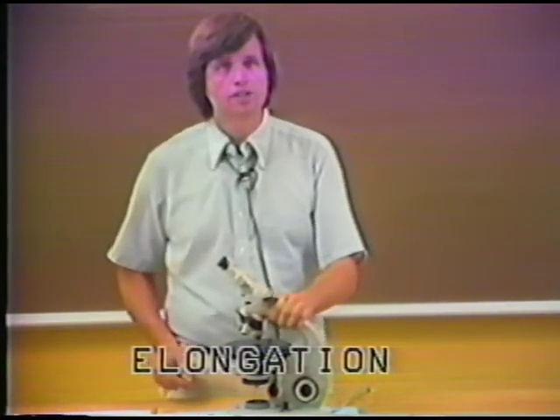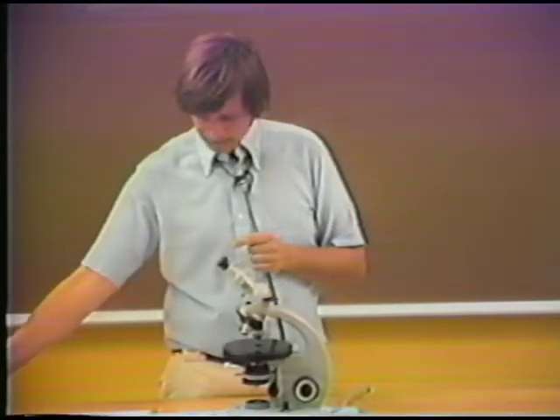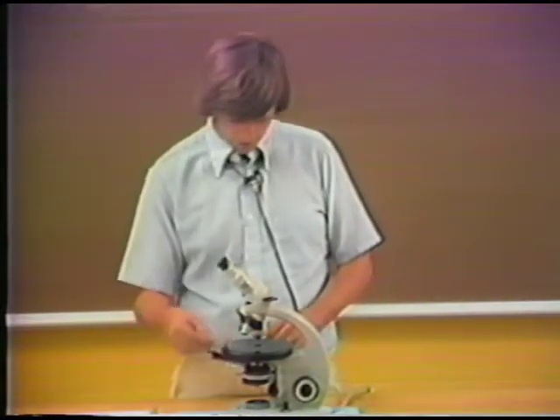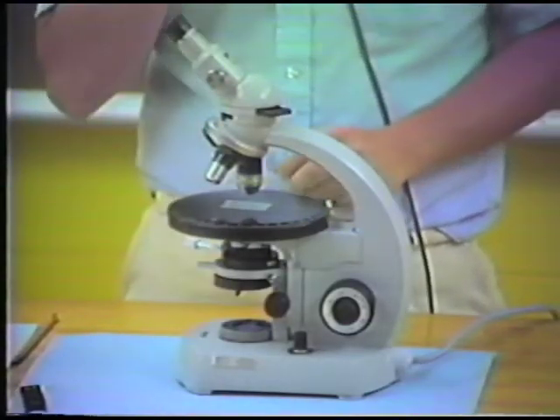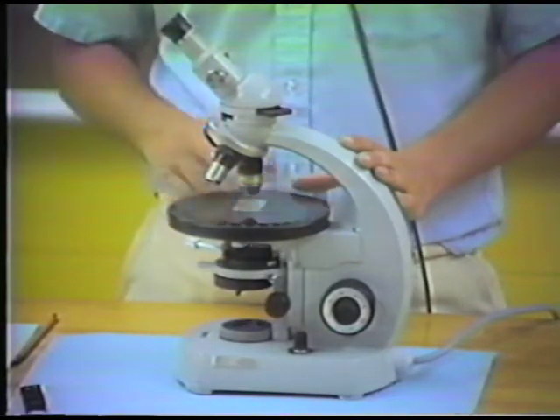Now, elongation really relates to the position of the slow ray relative to the shape of the mineral. And the basic nature of the test I can show on this mineral mount again, which I used for the purpose of parallel extinction. It's an elongate mineral which goes to extinction when it is parallel to the crosshairs.